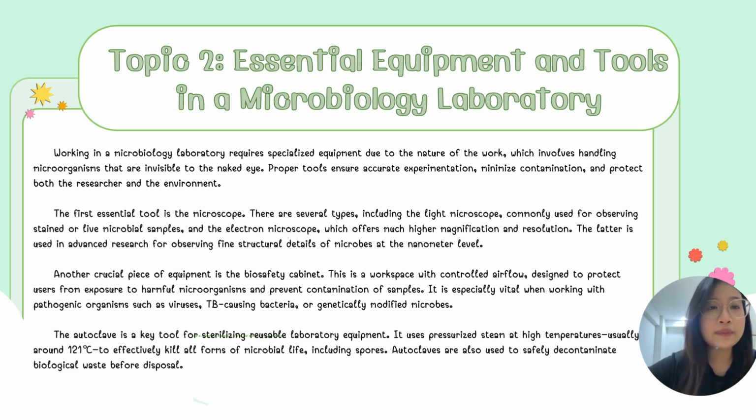The autoclave is a key tool for sterilizing reusable laboratory equipment. It uses pressurized steam at high temperature, usually around 121 Celsius, to effectively kill all forms of microbial life, including spores. Autoclaves are also used to safely decontaminate biological waste before disposal. Let's move to the next page.